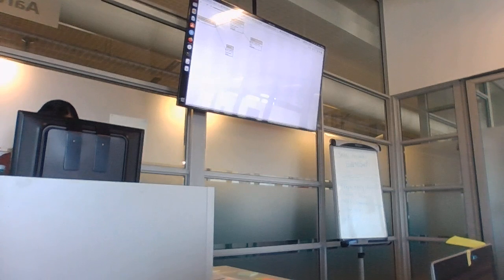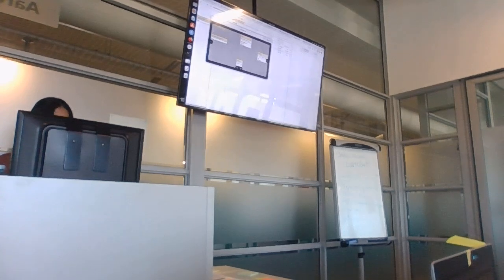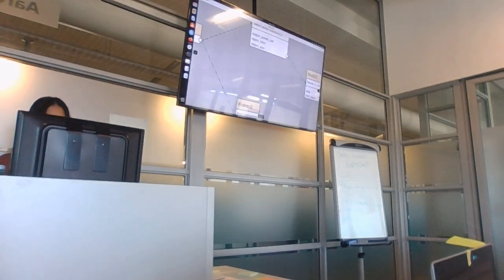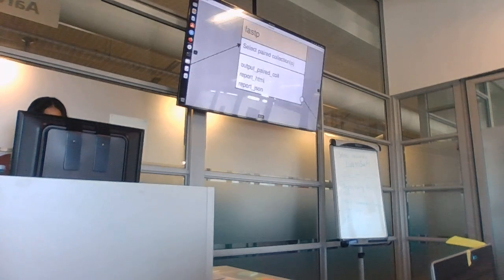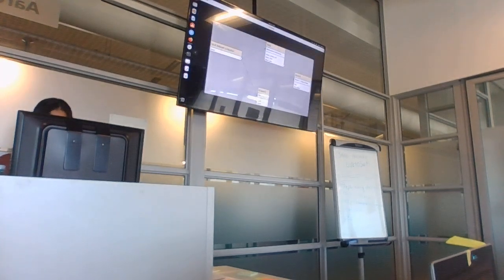But wait for this to complete. Yeah. Nice SVG for you to put on your huge billboard when you're driving on the highway, for everybody to see your work. Oh no. Can you explain it in short?